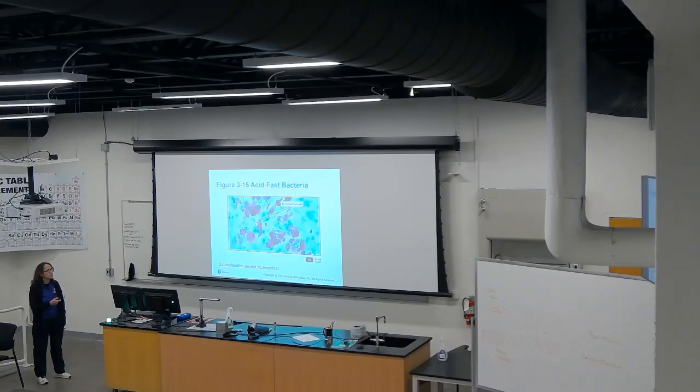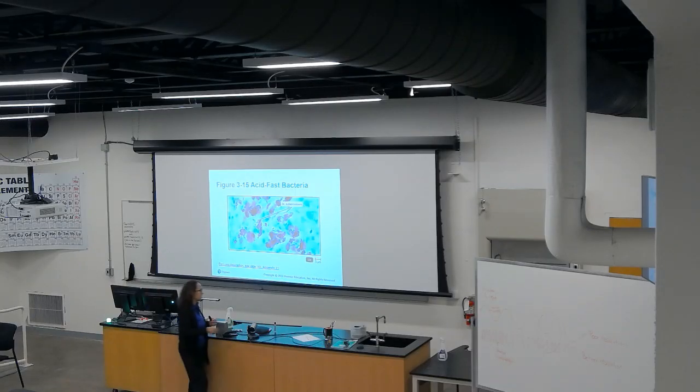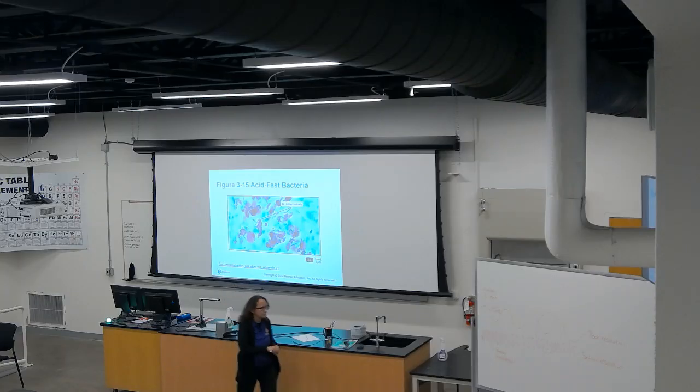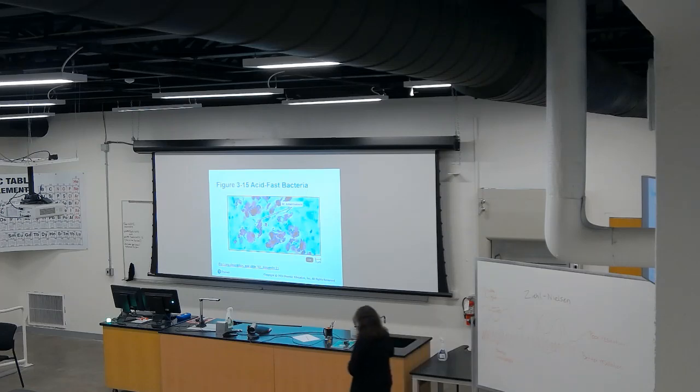And then we have variations. The technique that I explained to you is called Ziehl-Neelsen. It is based on the people who developed this technique. So that technique that I explained is the Ziehl-Neelsen technique.